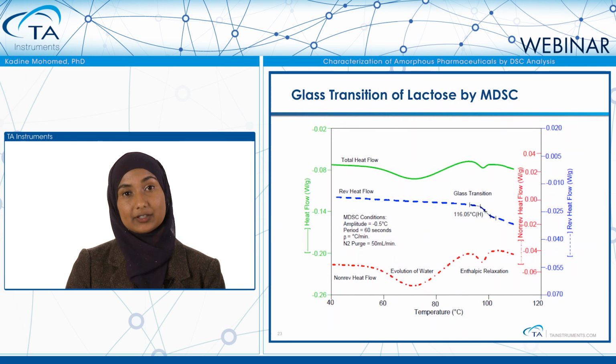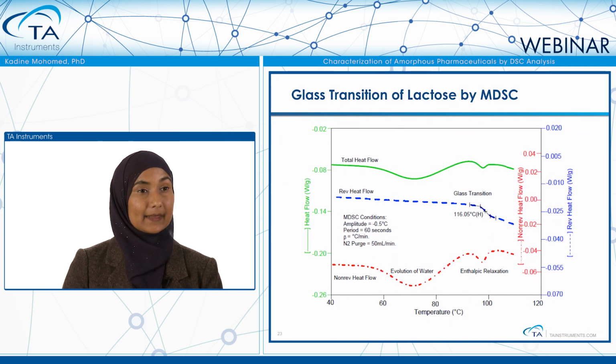Amorphous solids can certainly absorb water content from the atmosphere, and that water content is very loosely bound to the surface of the material. So on heat in, it's easily evolved and occurs as an endothermic change in the heat flow signal.